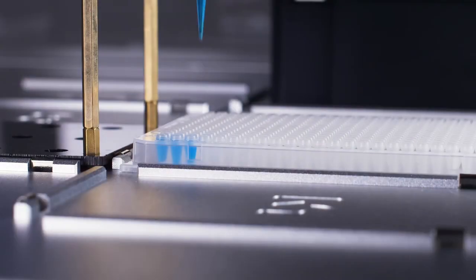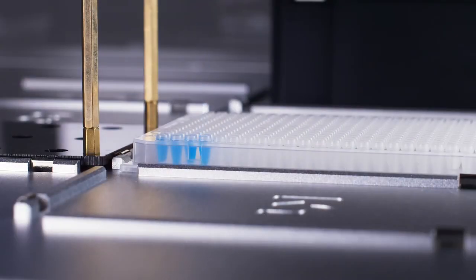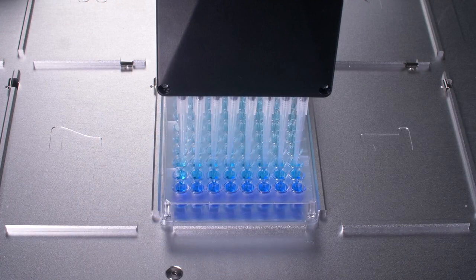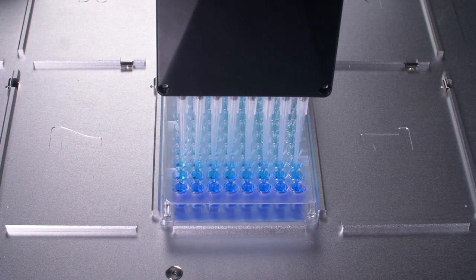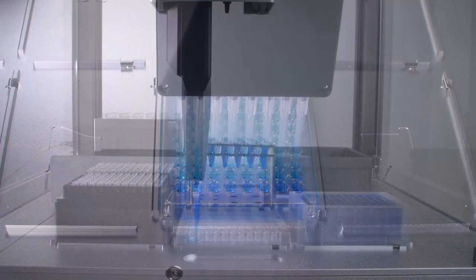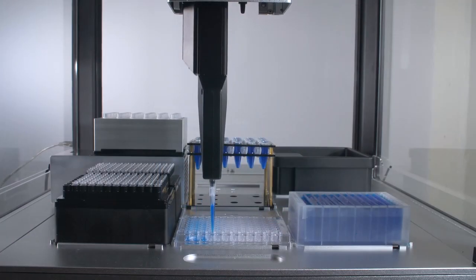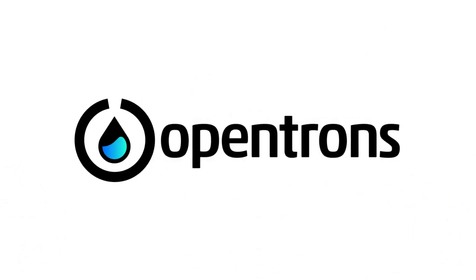The OT2 can also automate many other common life science protocols, ranging from simple serial dilutions to many step library preps. Contact us to learn more about how you can automate your lab work.